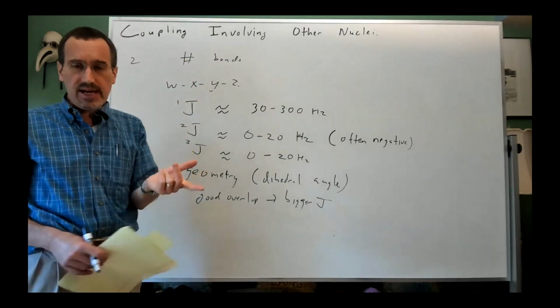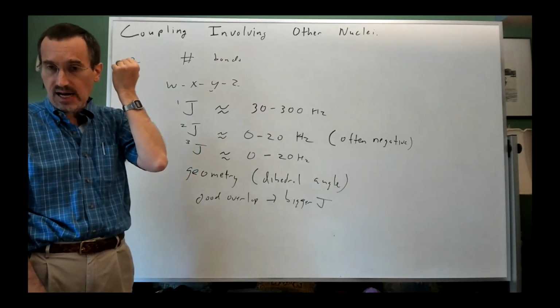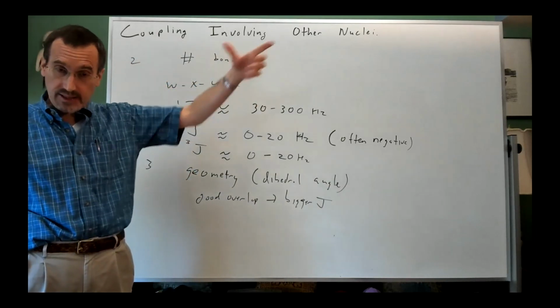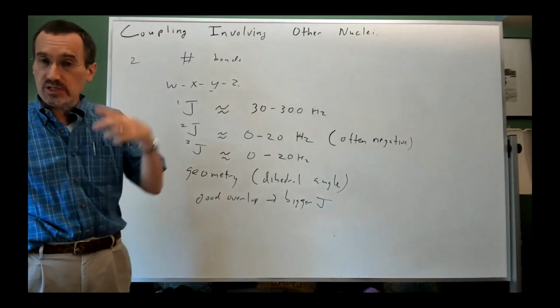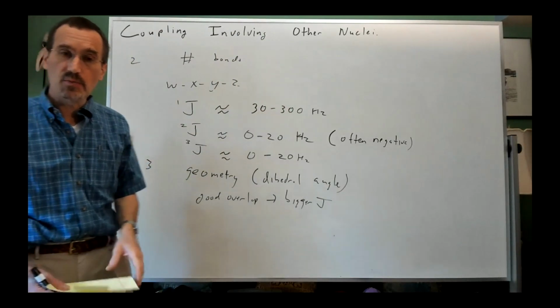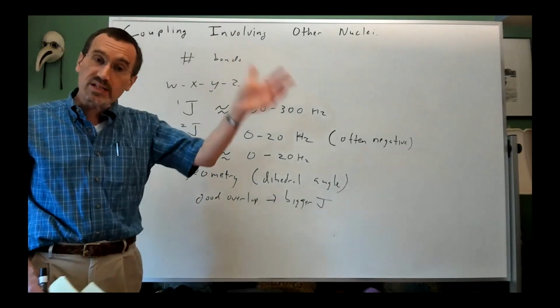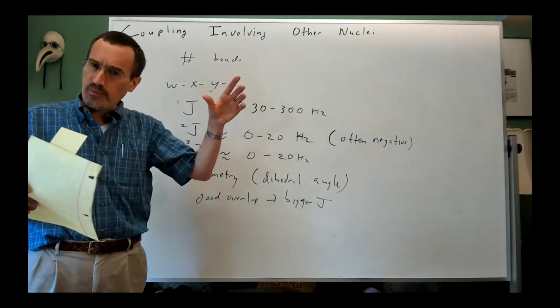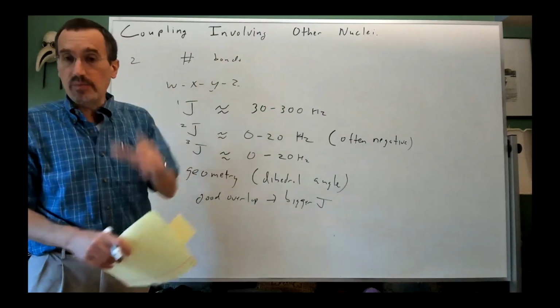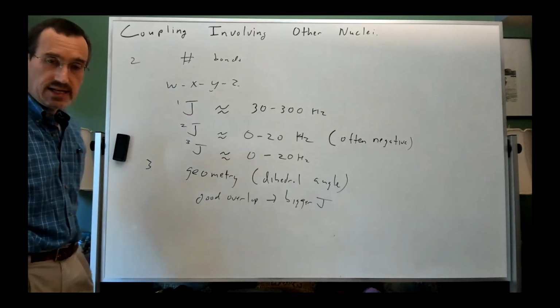And we saw real implications of that, when we talked about an anti-periplanar relationship on a cyclohexane ring from some stereochemistry, we said we expected that to be a big coupling. When we expected to see a gauche relationship, we expected it to be a small coupling. So even without doing anything fancy, we could predict, oh, this peak will be primarily triplet-like, this peak will be primarily quartet-like, and then there'll be smaller couplings superimposed on it. Thoughts or questions at this point?